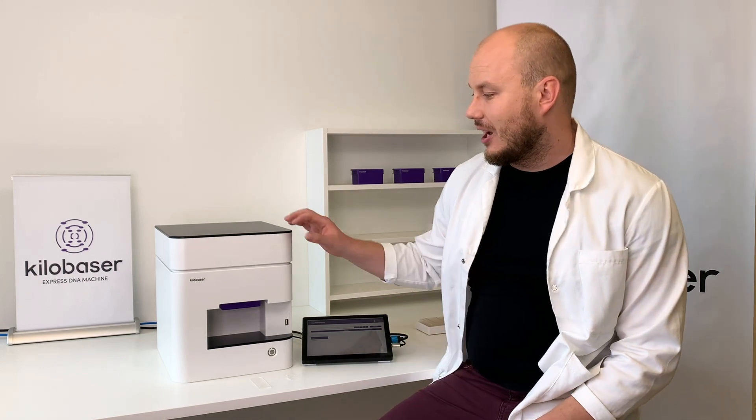Welcome to our first Kilobaser tutorial video. My name is Alex. I'm the CEO of the company Kilobaser, and this is our same-name first product, Kilobaser.